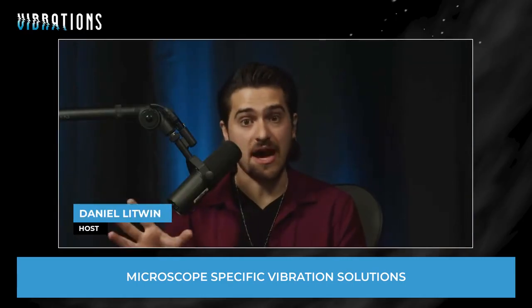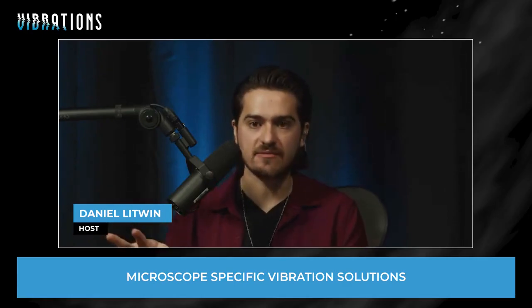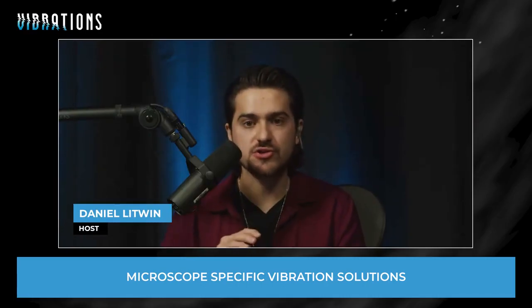Let's talk about down the road here for a second too. Another question I'm sure y'all get is about the long term of mitigating vibration. You invest in the right piece of equipment for your current VC curves, for your current vibration issues, and then things change. The foundation settles a little differently in the building.